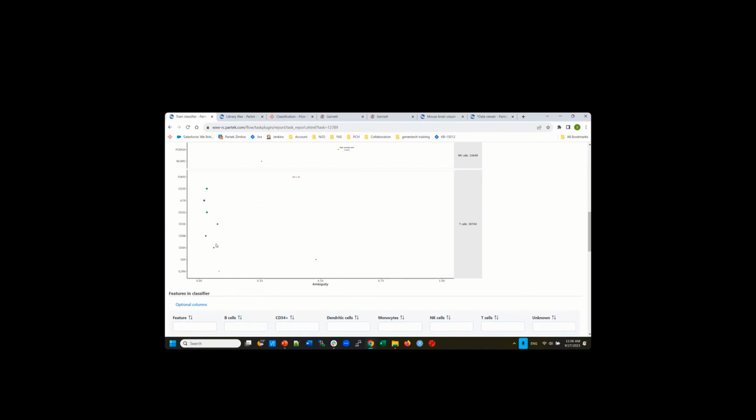So I think the nice thing about this one is you can tweak your marker genes. For some genes, this paper says it's a marker gene for this cell type, but another one says not. Based on your data, after you train it, you can see, oh, okay, those genes are good marker genes for this cell type.